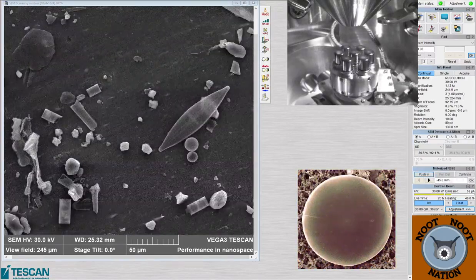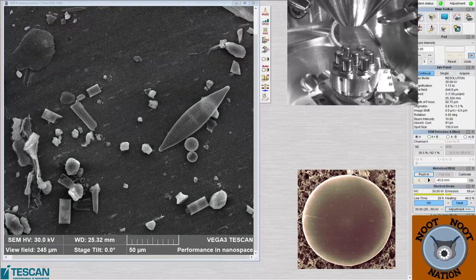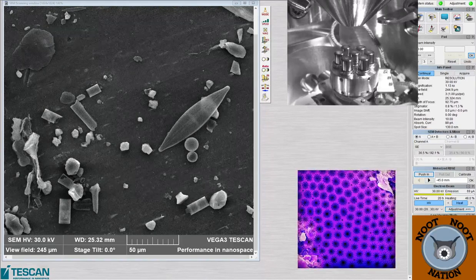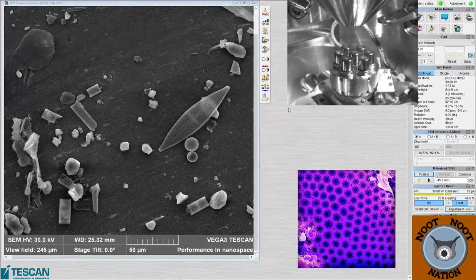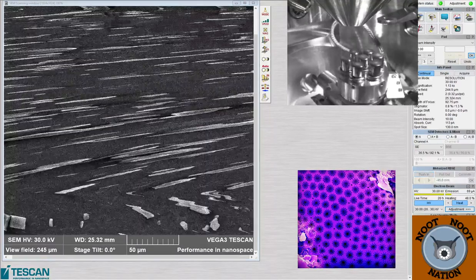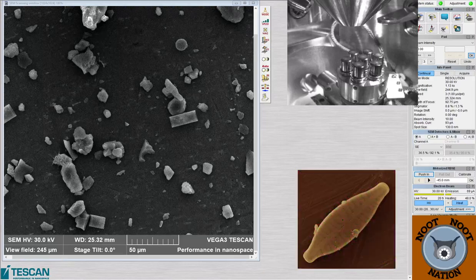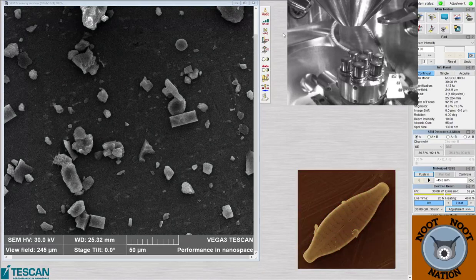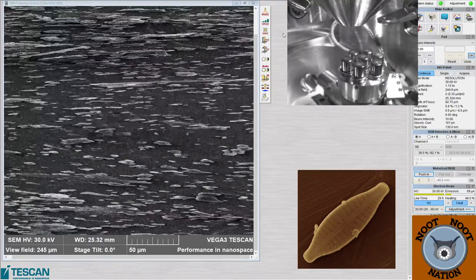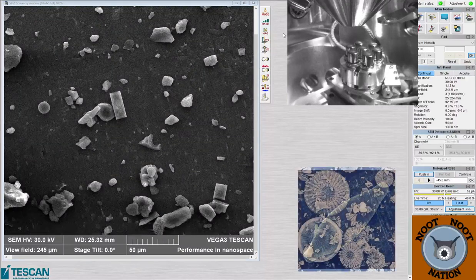If you're on the middle stub in that chamber view that you're seeing, it's fine. Most SEMs could probably handle that pretty easily. But what happens if we're out on the edge? Let's say we're on this stub out here, which is number one, and we wanted to rotate the stage around. So let's say I move it 90 degrees. Now watch what happens with the chamber when it does it. It moves the entire thing around while it rotates it to the right place.